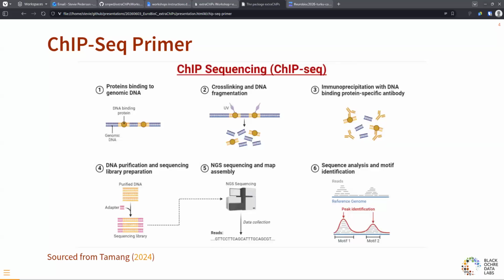I've never done an ATAC-Seq before, but a lot of people have talked to me about using this for ATAC-Seq, and I think the counting with ATAC might take a bit more care because you've got the Tn5 things. I've never worked on ATAC-Seq. But I was talking to someone who works on ATAC at BioC Asia last year, and they said it doesn't really matter. It's just counting, looking at differences in counting. So I have never tried it with ATAC, but it should work. Anyway, back to the script.